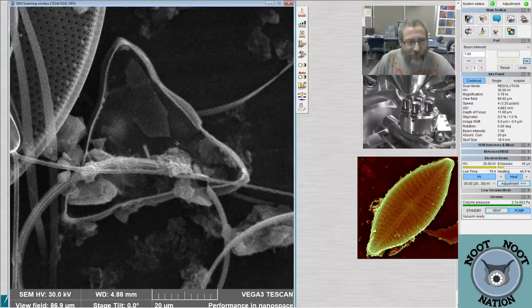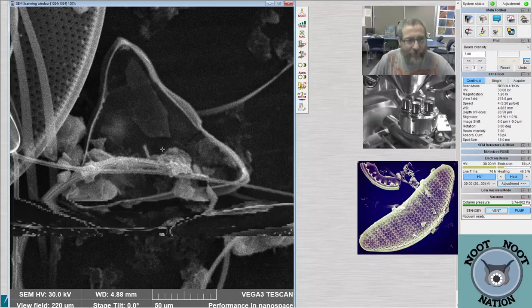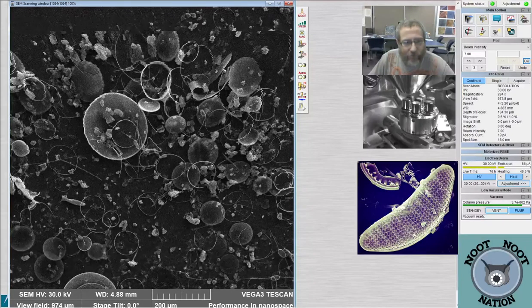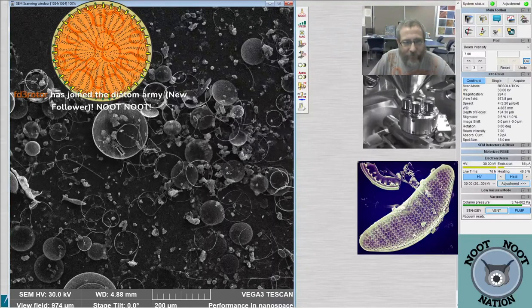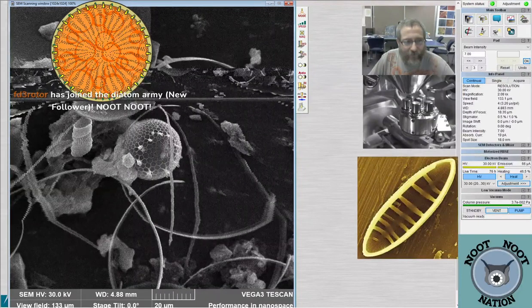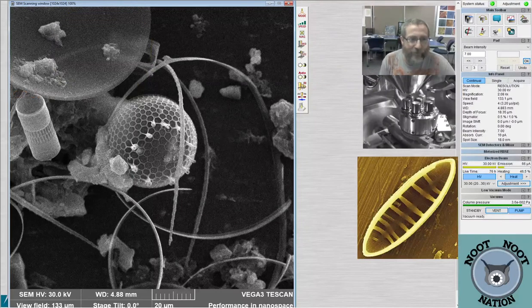Alien technology. I think maybe it's just a Ditylum with the spine broken. But, I don't know, have we seen an inside of a Ditylum? I know it's got lots of mess on it, so... We did see the inside of one before. And not today.